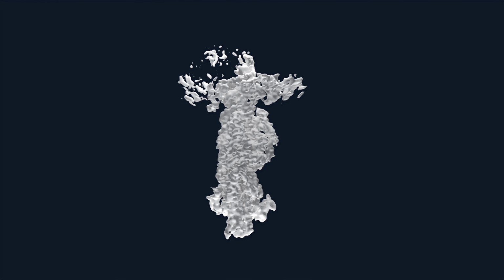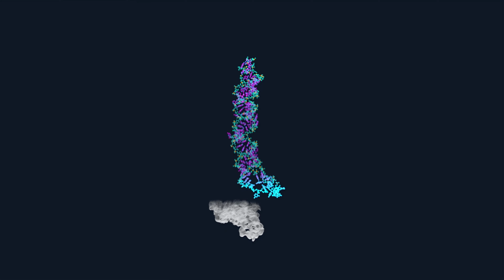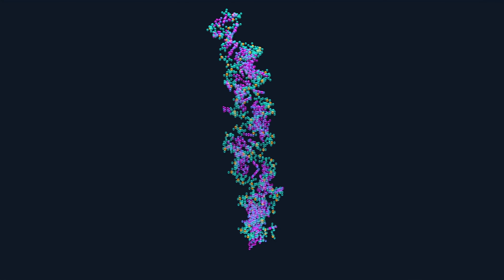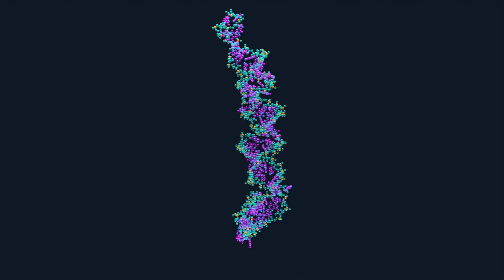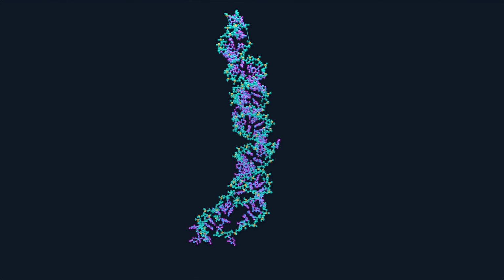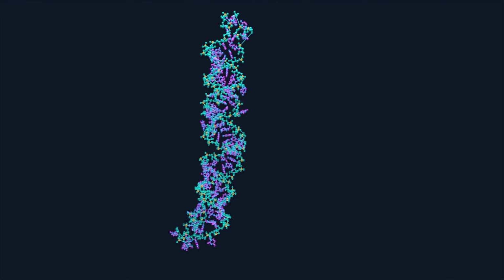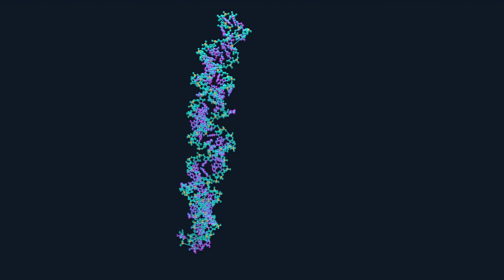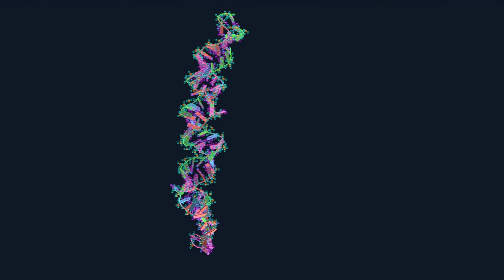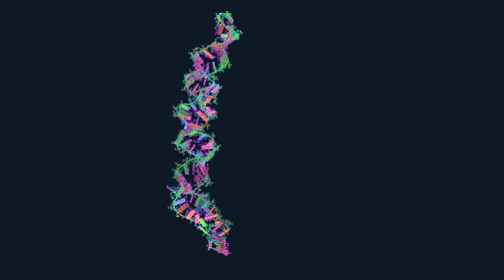First, in the Cryo-EM map, it detects structural elements using deep learning, identifying locations of phosphates, sugars, and bases, and it also identifies 4 base types. Next, it clusters these detected positions to identify representative nodes, and then a backbone is traced using a graph constructed from these nodes. Then after that, CryoREAD assigns sequences to local fragments along this backbone path and then assembles them. Finally, it constructs full nucleotides according to sugar-phosphate base triangles followed by atomic structure refinement. And then you have your completed structure model.